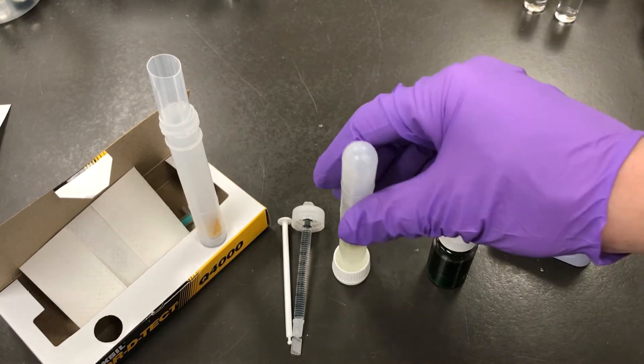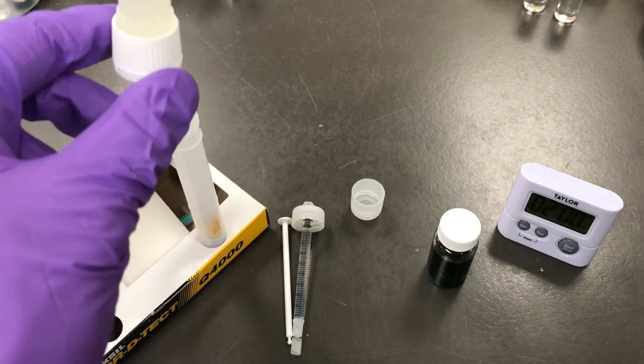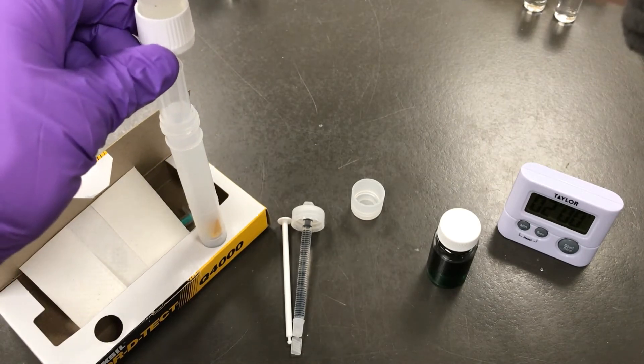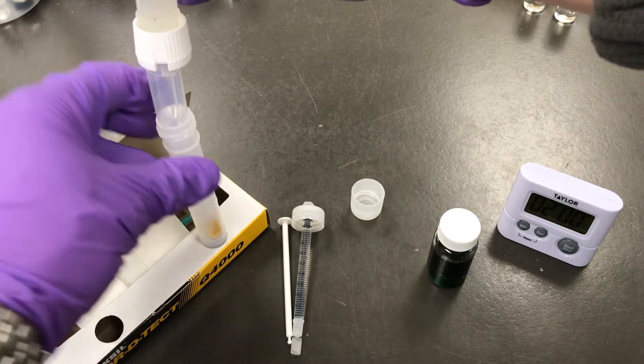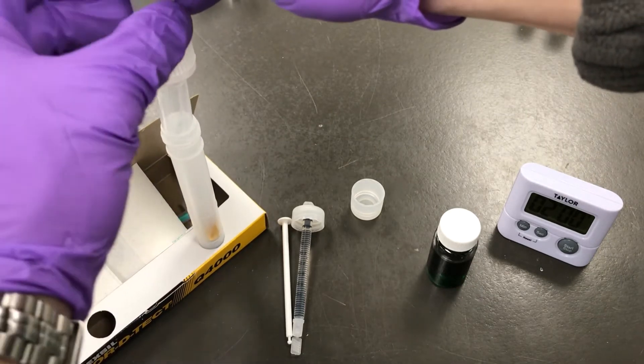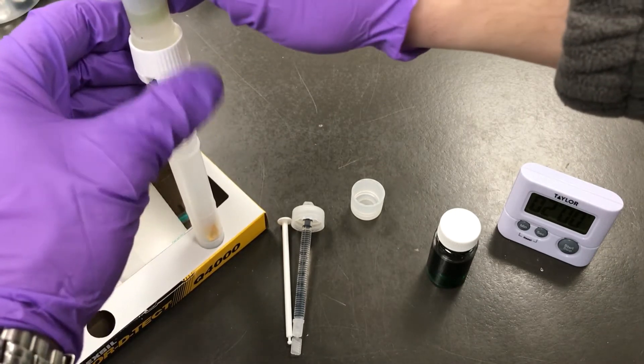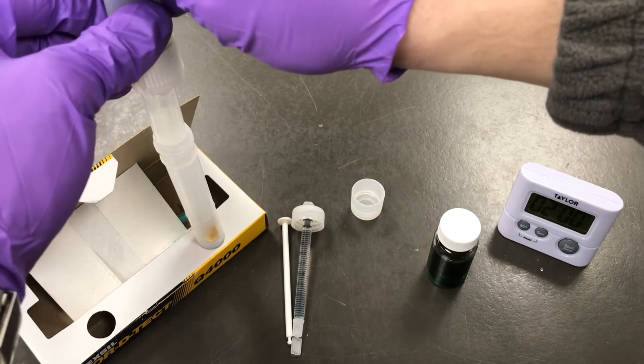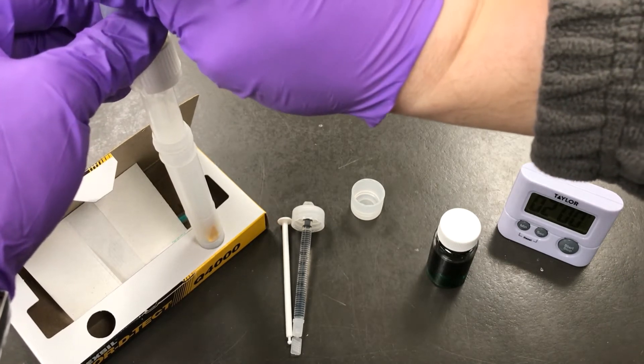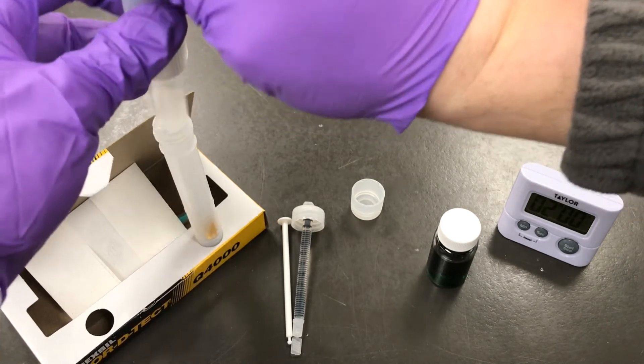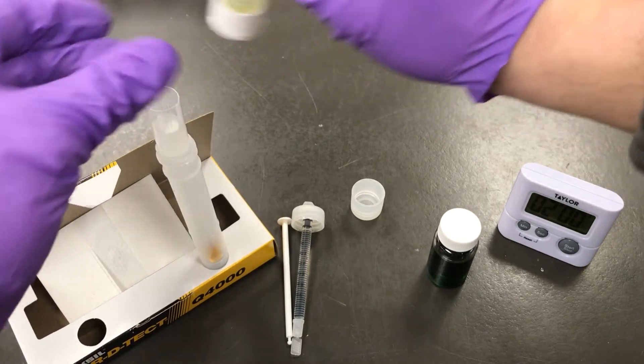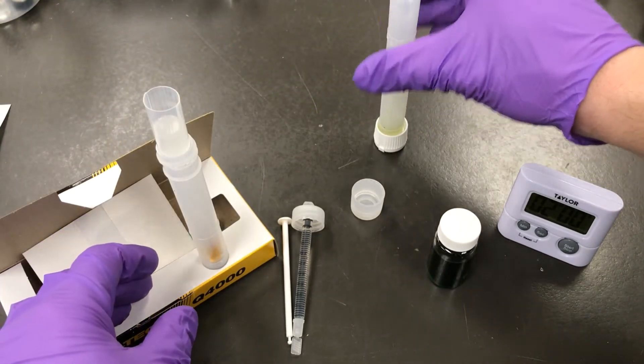When two minutes is up, carefully lift up test tube one, being careful not to tip it over. You don't want those phases to remix. Open the dispensing cap and filter the bottom aqueous layer only into the filter funnel. You want to try not to get any of the top oil layer into that filter funnel.